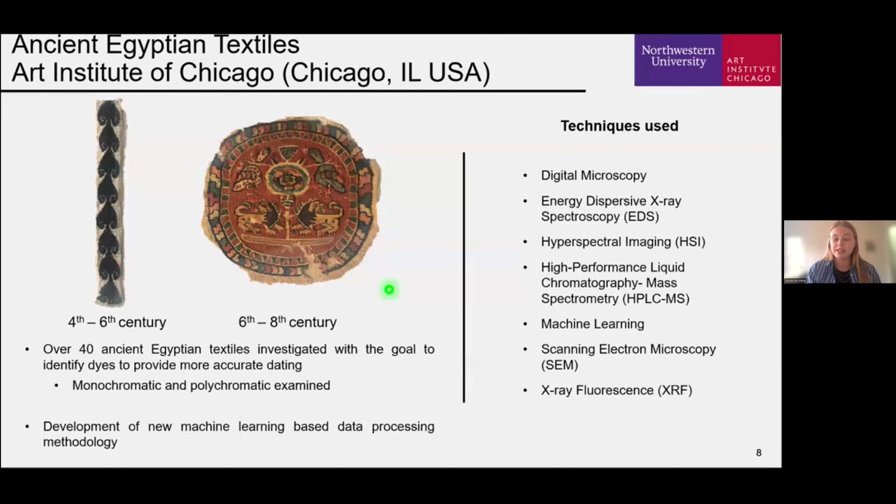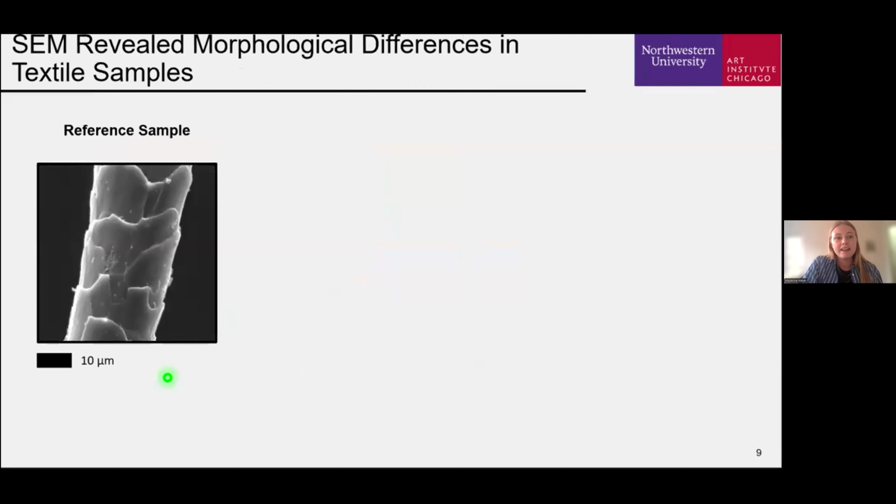The Art Institute of Chicago has a large collection of ancient Egyptian textiles, with the dates of these textiles ranging from the 1st century BC to the 13th century AD. In this project, over 40 textiles were examined via a combination of non-invasive and microdestructive techniques to identify dyes present in the samples.